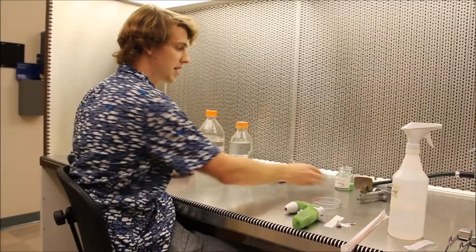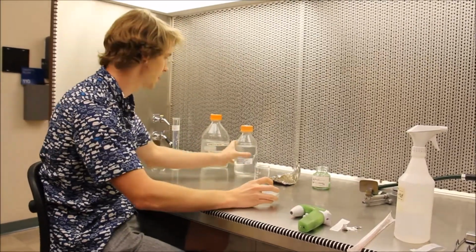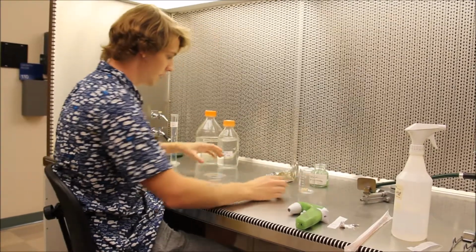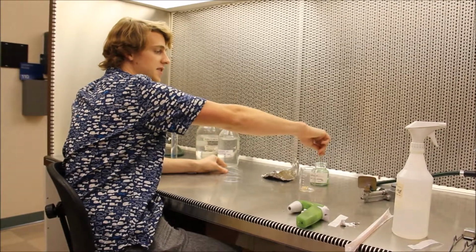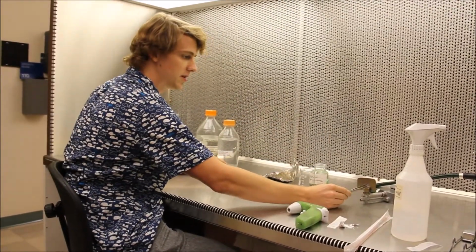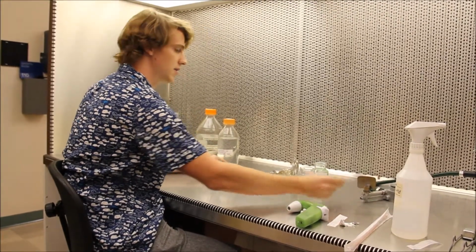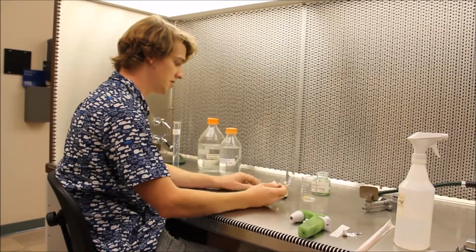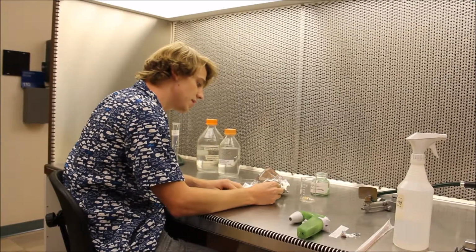You can move on to the next step, which is setting up your germination and co-cultivation plate. For this, we need an empty sterile petri dish, we need our sterile seeds, and we need filter paper that fits inside of petri dishes. So you make sure to flame your forceps, make sure everything stays sterile throughout this whole process. We autoclave filter paper in batches of 20 to facilitate using them.